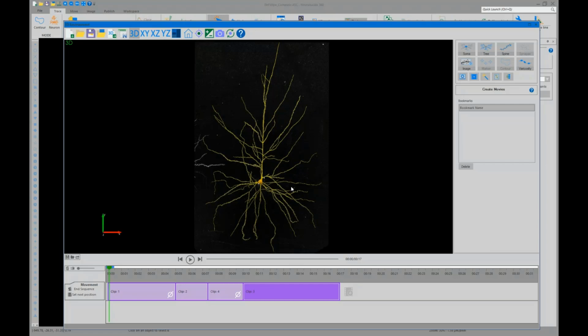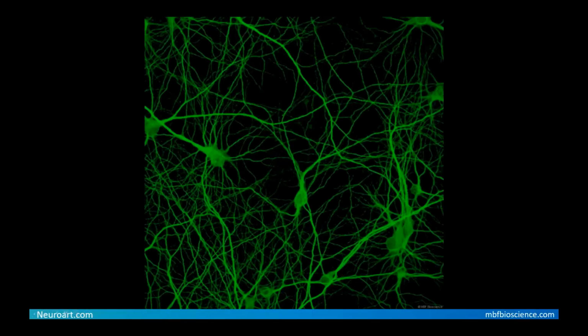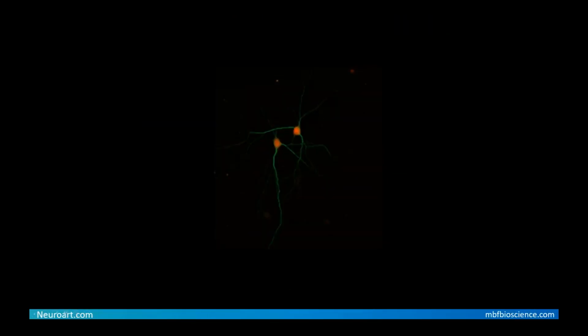You can continue to enrich your data file over a period of time. If you're using large volume reconstruction mode, that's an easy way to get the subsets of data for enriching particular areas as well. I hope we've been able to demonstrate at least a part of these newest features.